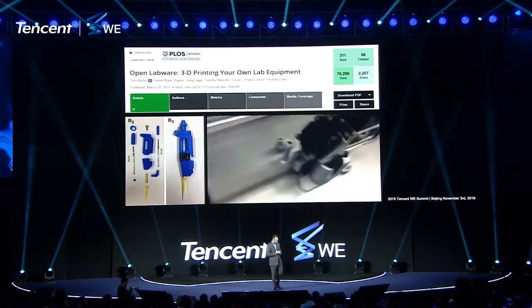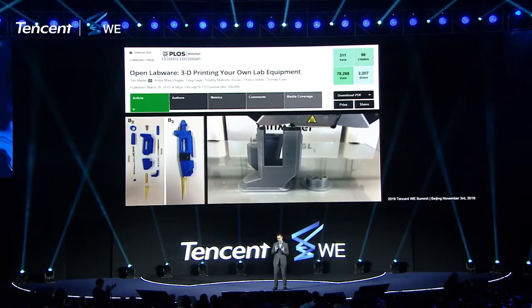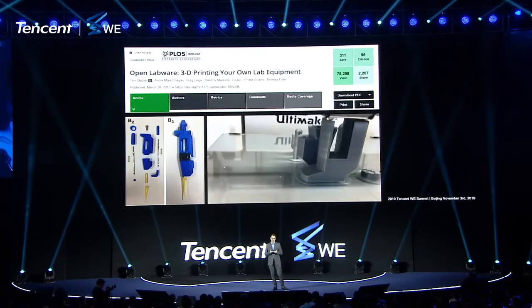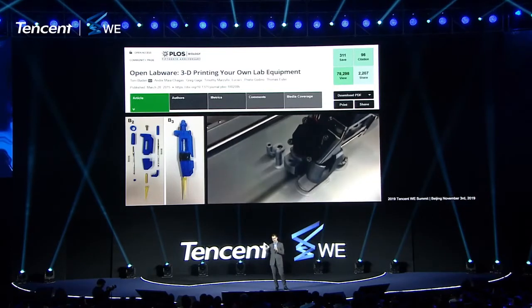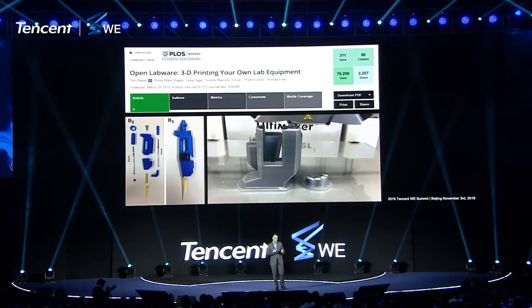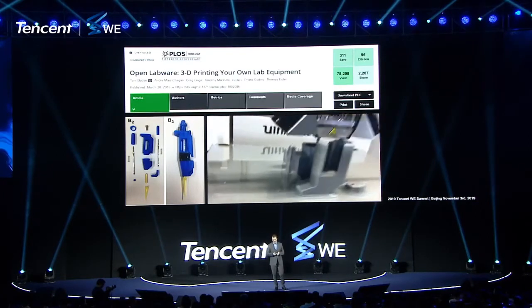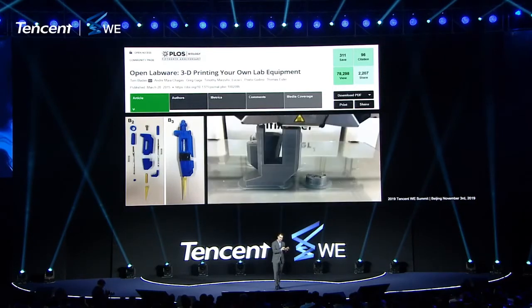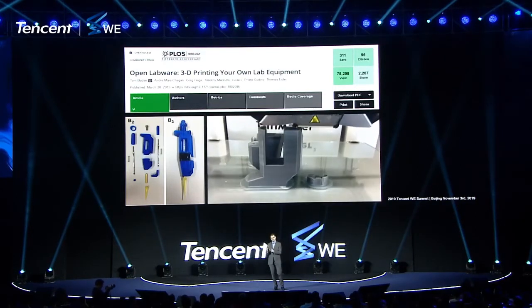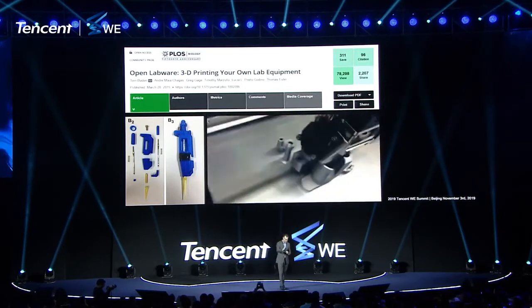And one thing that we did, just to make the point how this is possible, is we showcased a 3D printed pipette. Now, a pipette is an absolute cornerstone in any molecular biology lab. It allows you to transfer samples of whatever material you need to be transferring. So we put this 3D printed pipette in there. It was a reasonably good pipette, but it wasn't yet up to the standard that you might find in a commercial one. But critically, we put the plans of this pipette up.